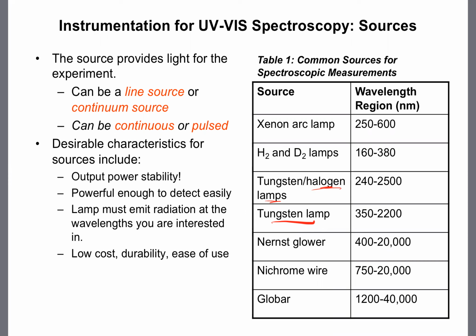So if you've got this filament, let's say that's made out of tungsten, right? You pass a current through it, it gets really hot. Well, the tungsten atoms basically come off to the gas phase. And in the gas phase, they can react with the iodine or the halogen, which has been added. And that basically causes them to form a stable form rather than deposit onto the surface of the glass where they're just basically removed due to condensation on the glass.